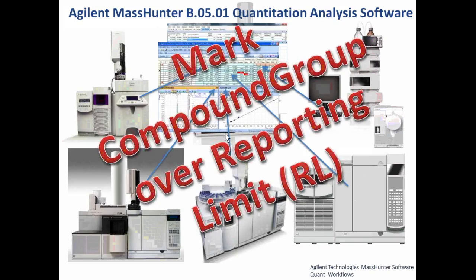Let me show you a mechanism to speed up reporting, especially for large batches where you have low hit rates. And it's important to understand how that works. The mechanism is to mark the compound group over that reporting limit. Use the sample outlier to measure.